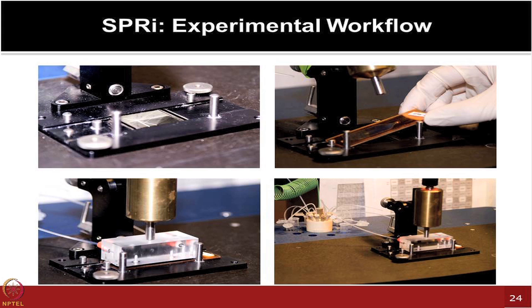It probably reminds Josh of one of the old prototype setups we had, where you can now test 8 antibodies, for example, or 8 different proteins in a very new format. You are developing a new instrument setup, and these kinds of solutions are coming in. You have the gold chip, everything is passing through, and then it goes back into the washing containers.